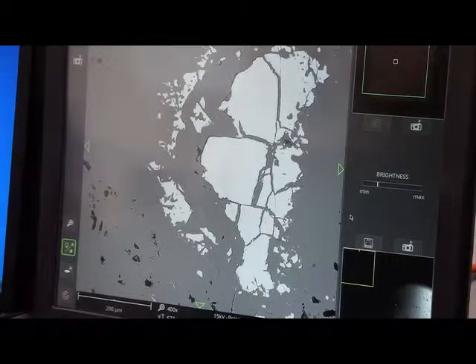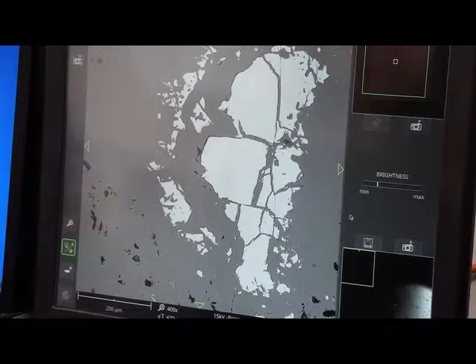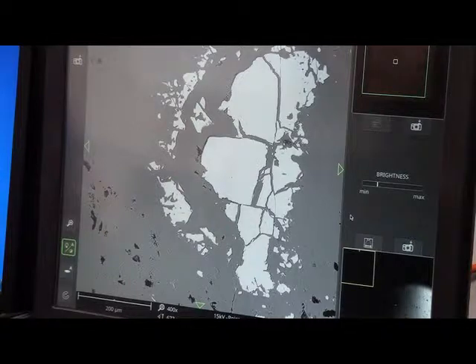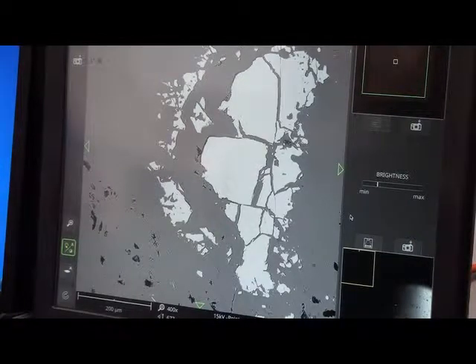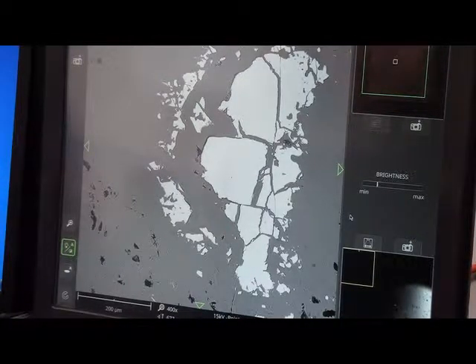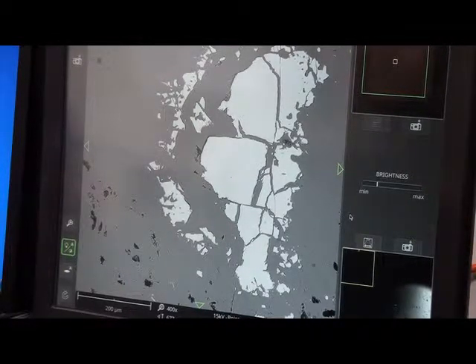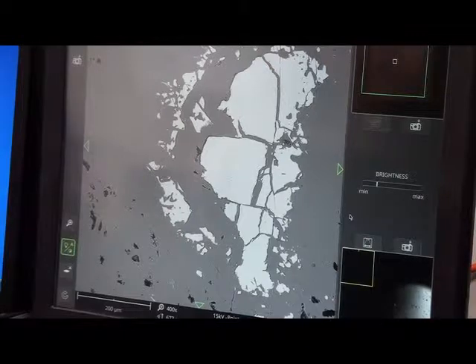This is a metamorphic rock which means it's undergone changes from its original composition due to fluid moving through the rock, due to changes in temperature and changes in pressure.